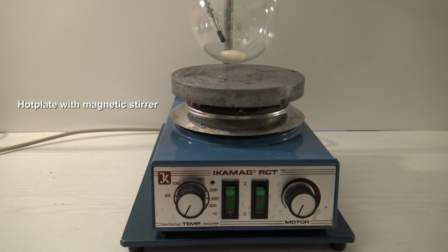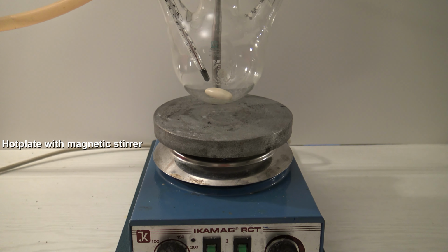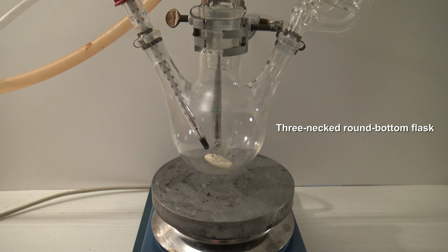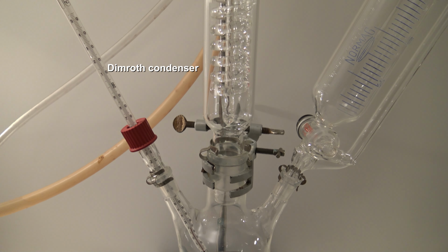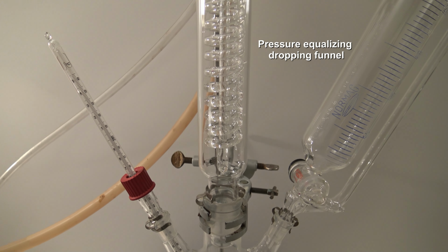The apparatus consists of a hot plate with a magnetic stirrer, a three-necked round-bottom flask with stirring bar and a thermometer, a Dimroth condenser, and a pressure equalizing dropping funnel.